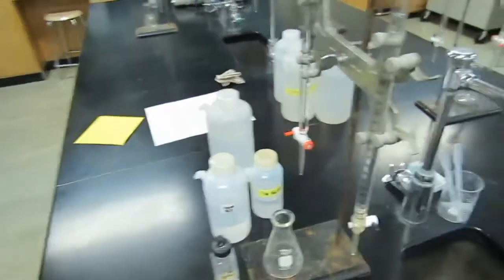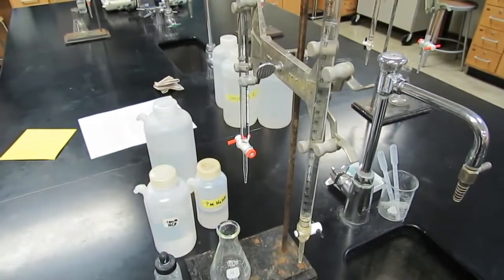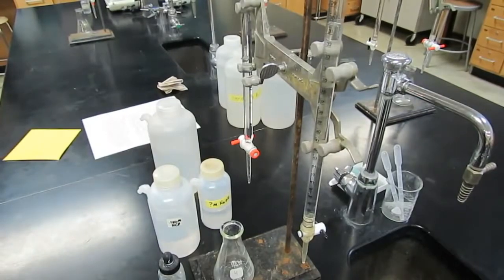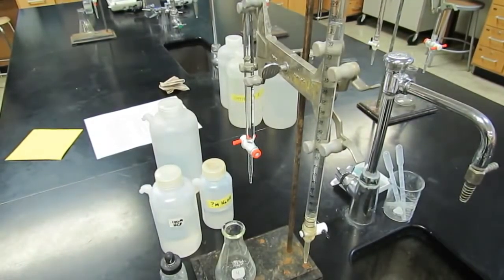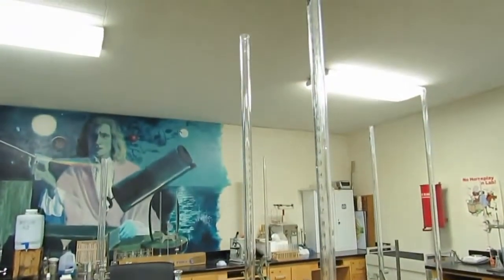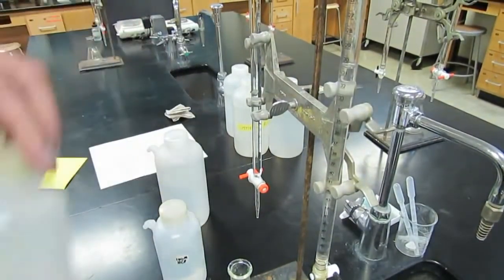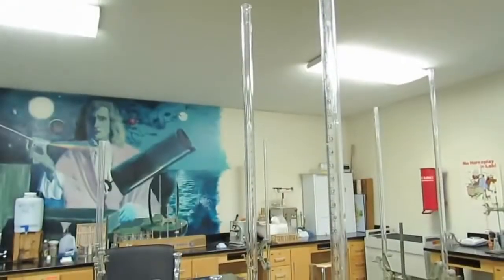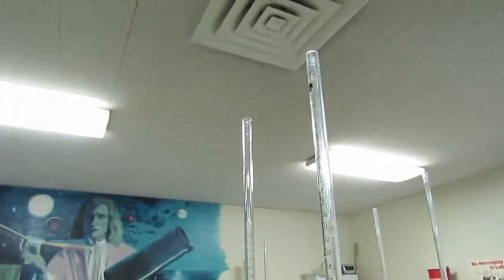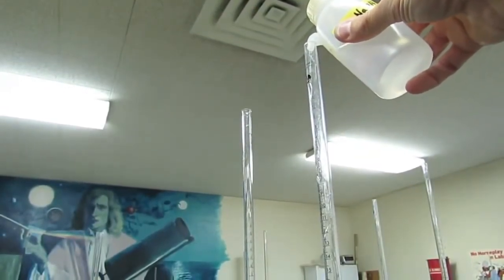Now the first thing we're going to need to do is to fill our burettes. We'll actually have had them cleaned. They'll have been rinsed with the solution in which we'll be titrating with. So what you'll need to do is you'll have to top them off and take what's called an initial reading. So on the right hand side we are going to be using base. So you'll take your base and you will simply fill this up past the 0 mark on the burette.